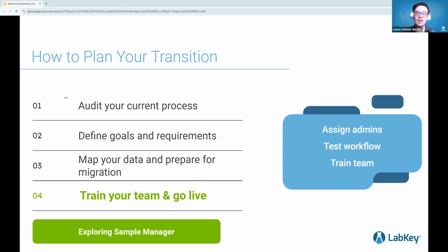Other times, folks will set up training sample types to use, and this makes it very apparent in their audit logs that this is fake data. So if you're going back through, you'll be like, oh, this was our fake sample type. It's not real data. This was just when we were training. With that, it's related to ensuring that your teams are trained and fully confident.